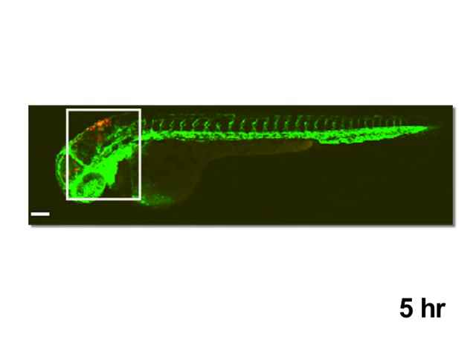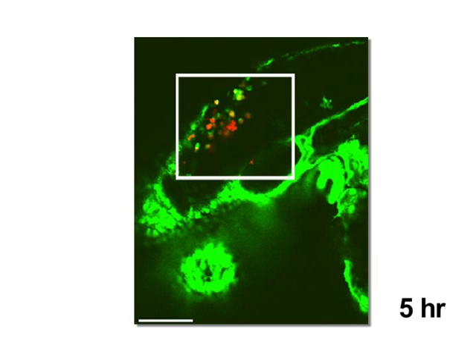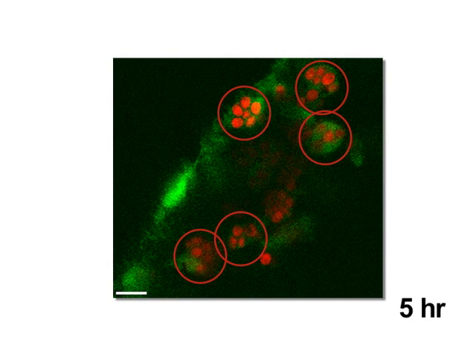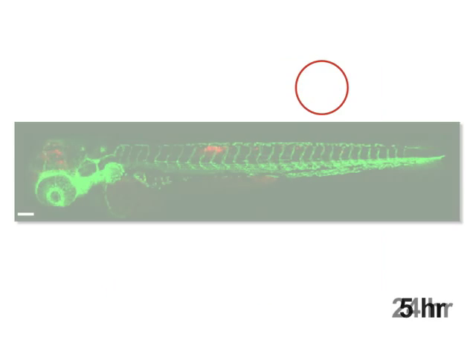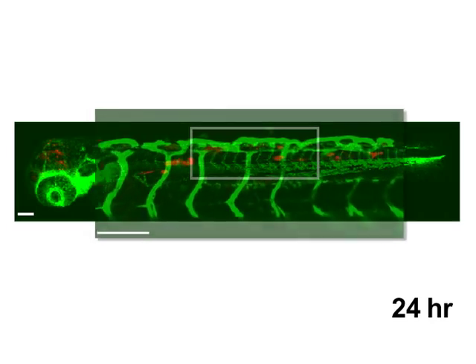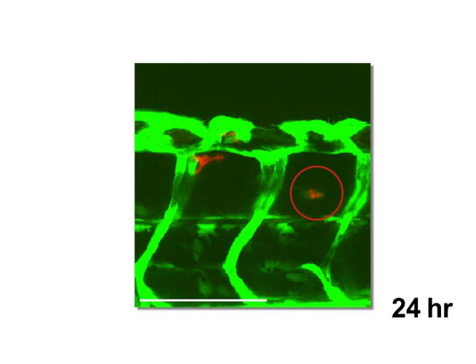Five hours after infecting zebrafish with red fluorescent Candida albicans, the yeast is visible in the fish's hindbrain. In FLI-1 EGFP fish such as these, the vascular endothelium and macrophage-like cells throughout the fish's body are fluorescent, shown here in green. Five hours after infection, the yeast can be seen within macrophage-like cells. By 24 hours, the infection has disseminated along the dorsal tail tissue, where the yeast can again be detected within phagocytic cells.